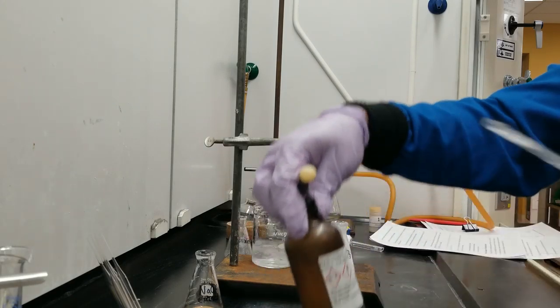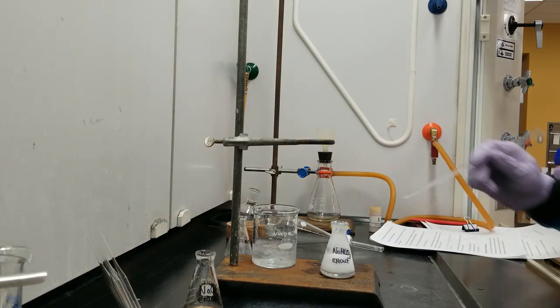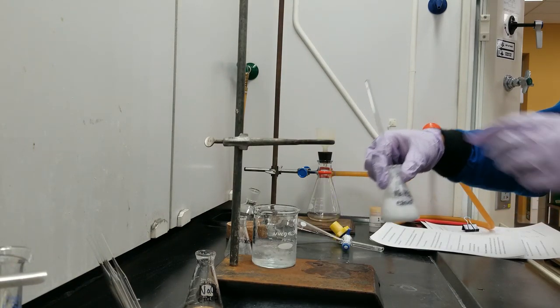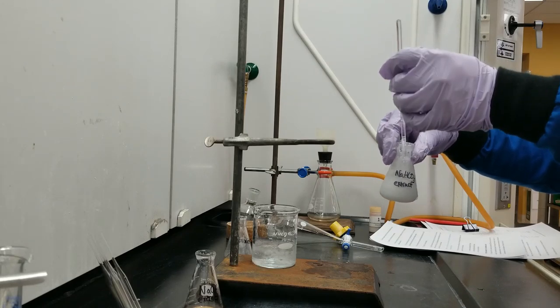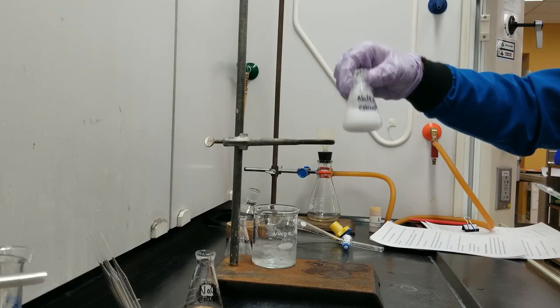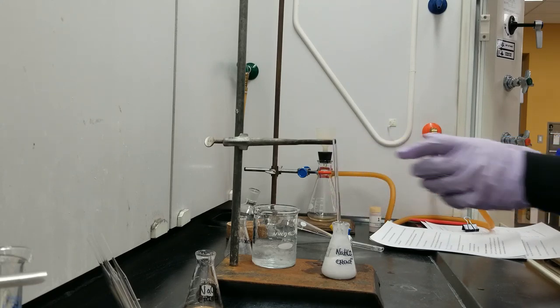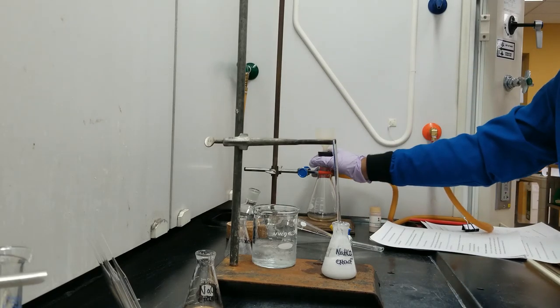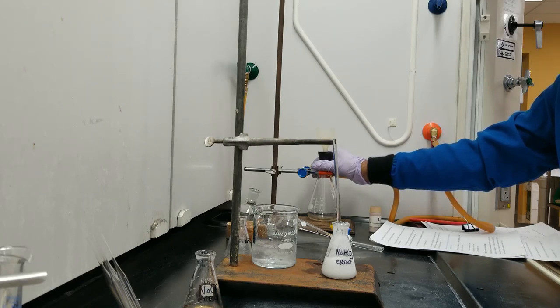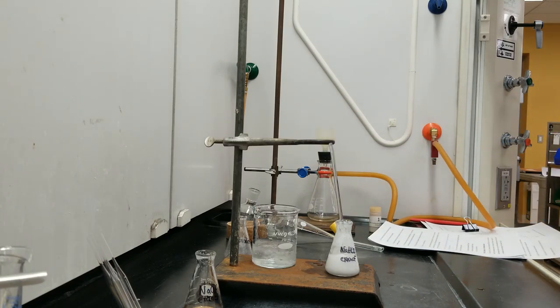We'll keep the concentrated acid aside and we'll start filtering the solid out. You can probably see the solid in the flask, which is precipitated due to the acid-base reaction that just happened. And we have assembled a Buchner setup for the filtration of this chlorobenzoic acid from the solution.